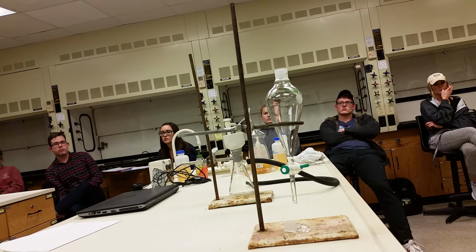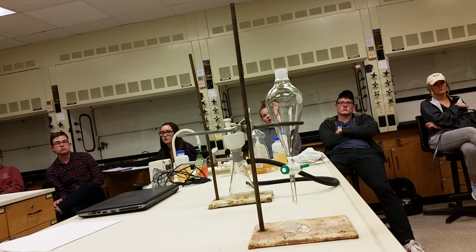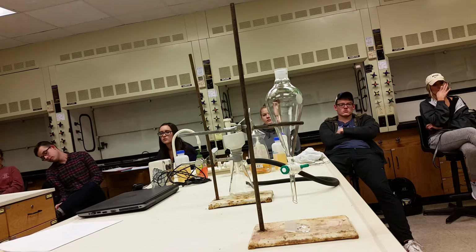Once you're in the 50 milliliter Erlenmeyer flask, you have to dry the organic layer by adding anhydrous magnesium sulfate, MgSO4. You add a little bit, and you see if there's any clumping. If there is, that means there's water present, so you add a little bit more. It's a trial to get it right, but eventually you get there. Then you need to get rid of that by filtering it off.